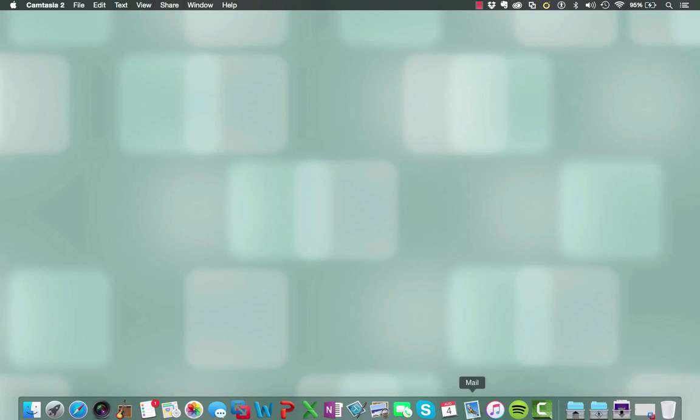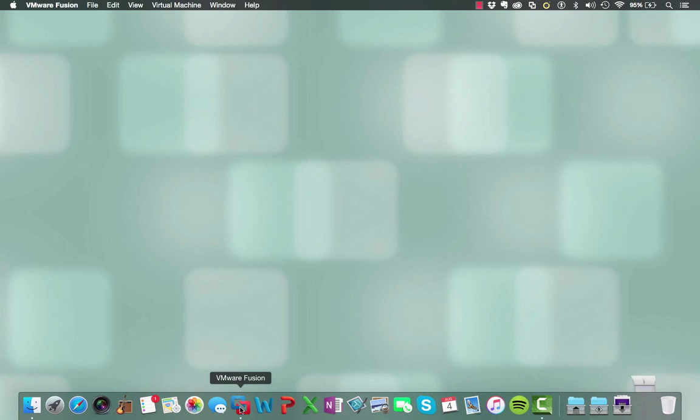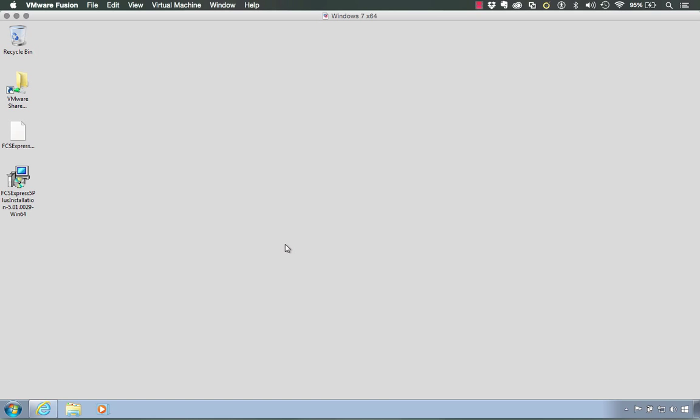So for today's demo, what I'm going to show you is how we can use FCS Express 5 on a Mac through the use of VMware Fusion 7 specifically. Okay, so I do have VMware Fusion 7 installed on here. So I'm just going to open it up from my dock. And I already have Windows 7 64-bit running in the background.